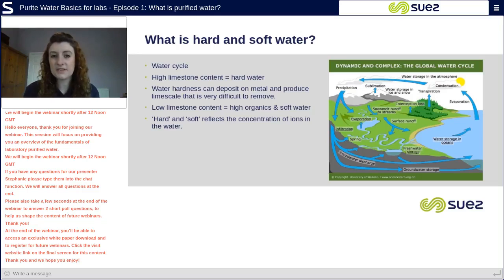Water hardness can stick to pipes and kettles, producing limescale, which is hard to remove. Hard water also causes problems in water systems, and therefore these minerals have to be removed by specialised technologies, which we will cover in a subsequent episode.